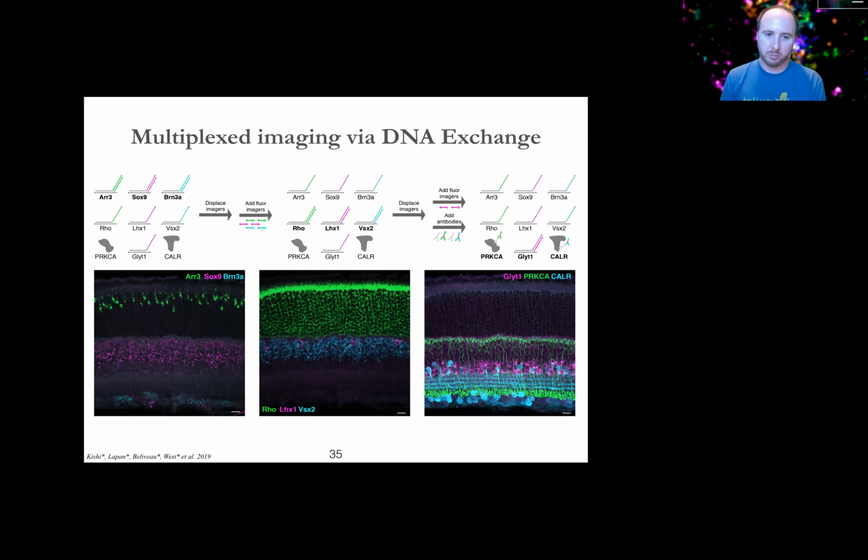And there's just no way to get around that bounding if you're trying to do a 1-to-1 stoichiometry between target site and labeled oligo. But SABER cheats because we make a whole big repeat where there are many, many copies of the same binding site repeated over and over. So we don't actually necessarily have to get to saturation. We just need to get enough oligo on there that we can see the thing. And we can do that much faster because we have that kinetic advantage. I think this is on the order of 5 or 10-fold faster than anything else you can do right now, just in terms of how long each association step takes.